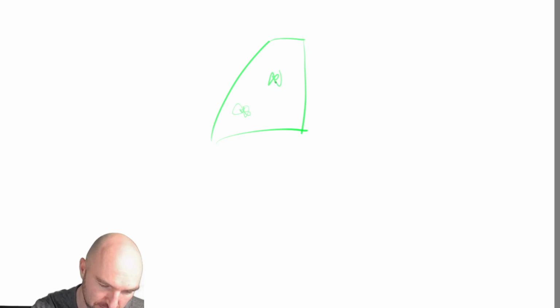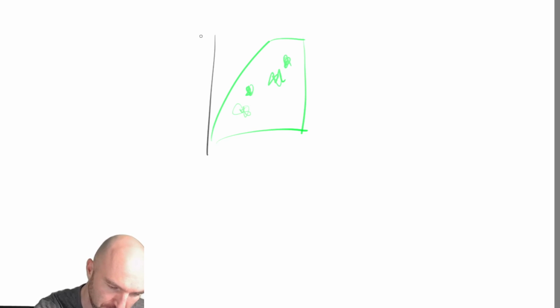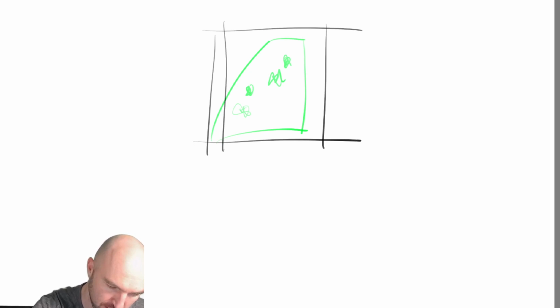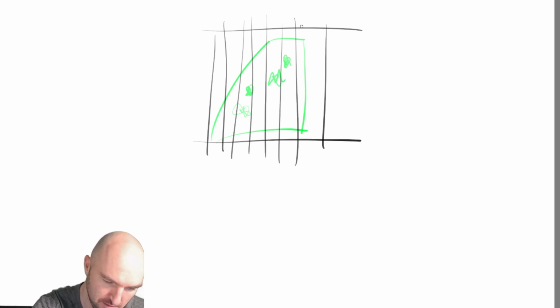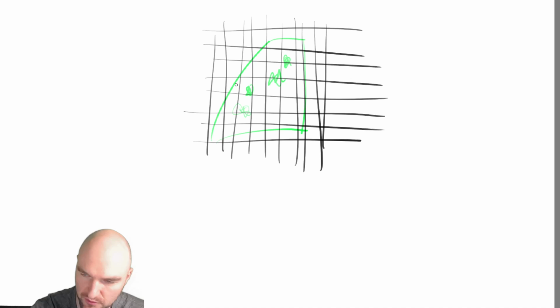So essentially, when we're creating our voxelization, we're saying, okay, this is the atom probe data set, with all kinds of things in it, a couple of precipitates in our case. And we are essentially creating a grid and calculating the concentration. Of course, our grid has to be fine enough to account for the small details in here. So this would be a much too large grid pitch. But what happens inside here is that we are calculating the concentration in each of those voxels.